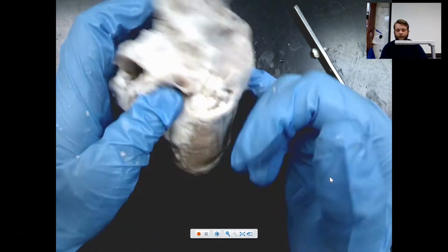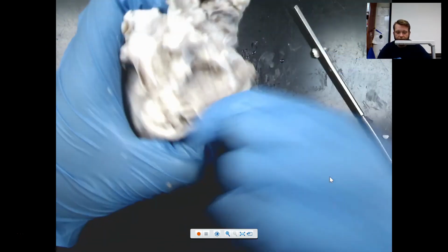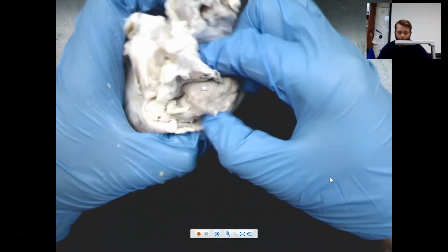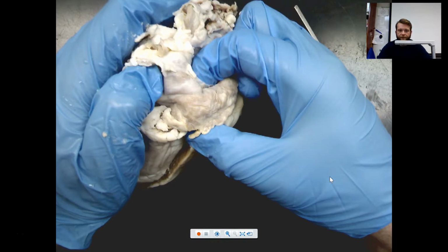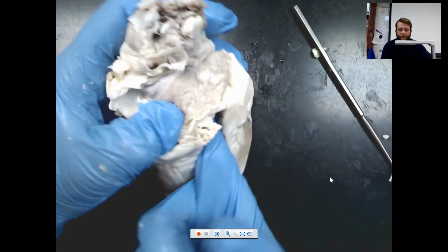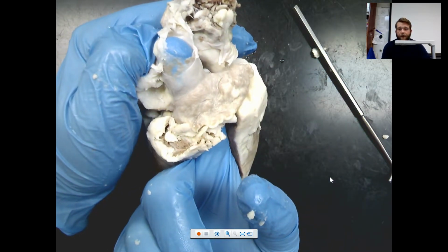Okay. If you look on this side with our right atria, we're going to see this vessel that's right here. This vessel that's going directly into our auricle. So this flap right here. So this wide vessel here that's actually collecting blood, and if I put my finger through here, you can see it from the inside of the heart.